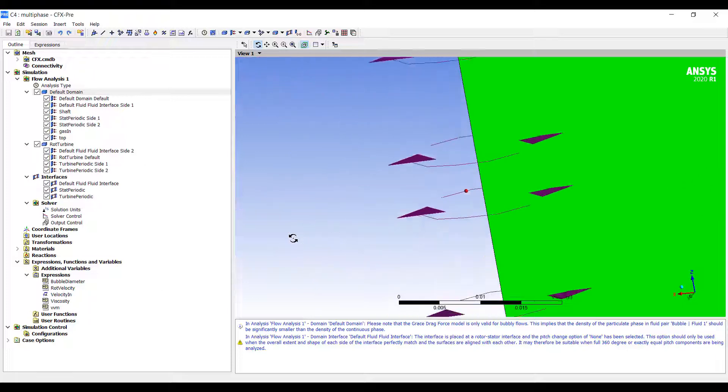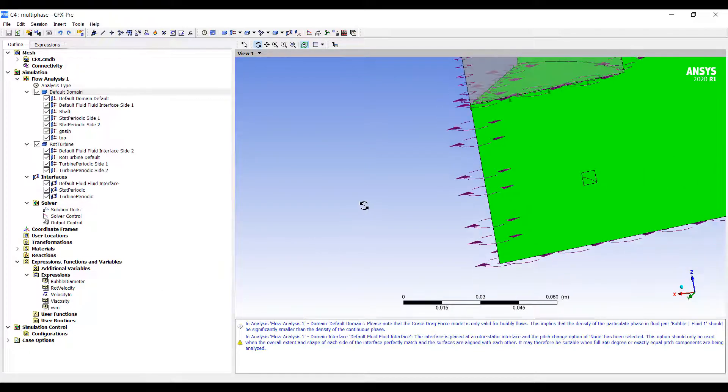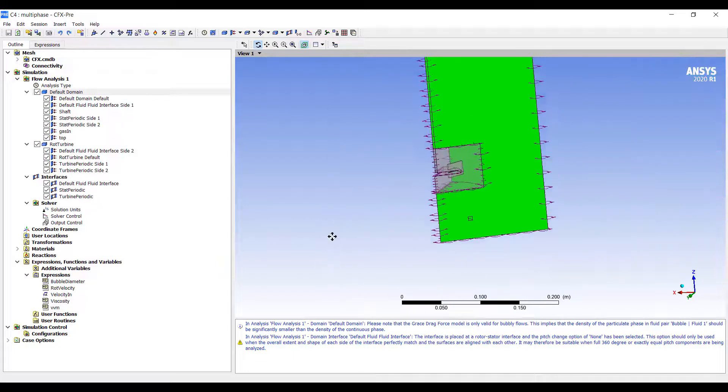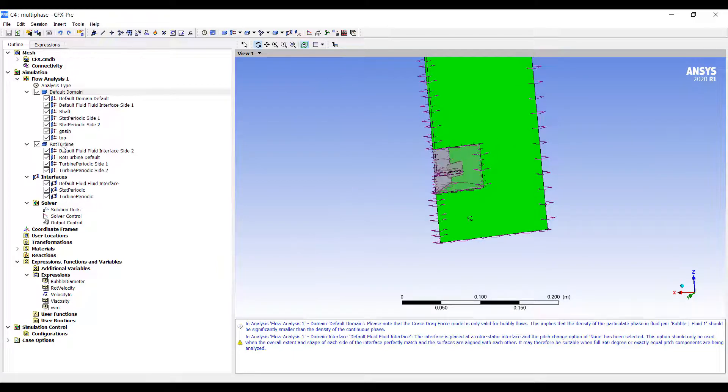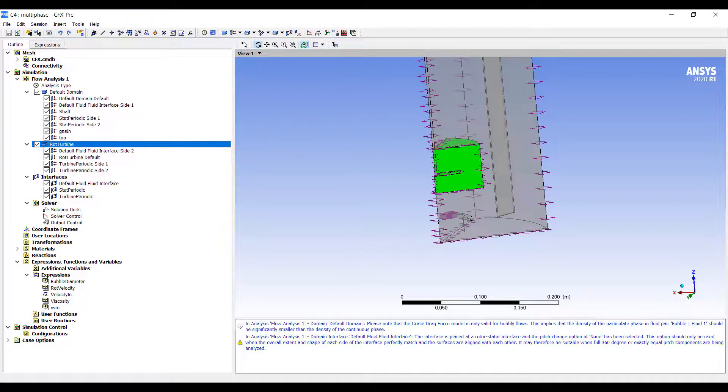This shows you how flexible ANSYS CFD is. We can turn almost anything inside of a simulation into parameters. Any value we can input. That's on the input side.